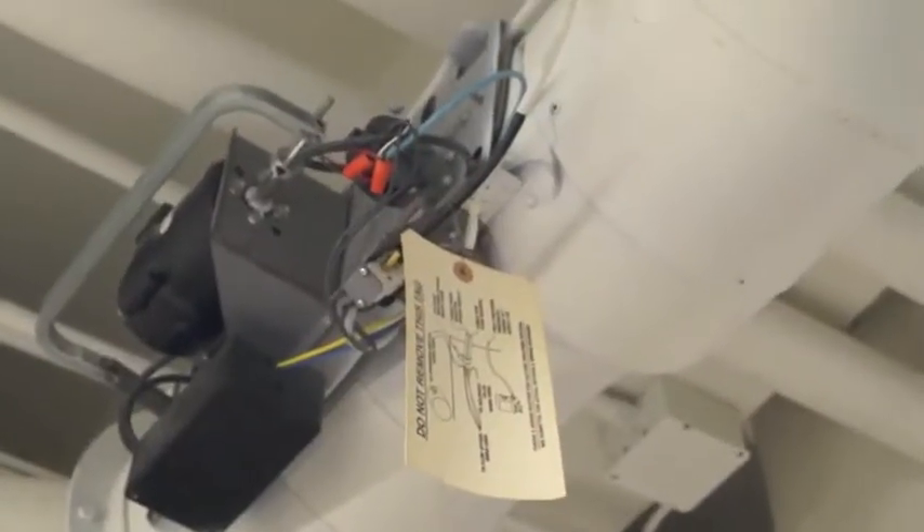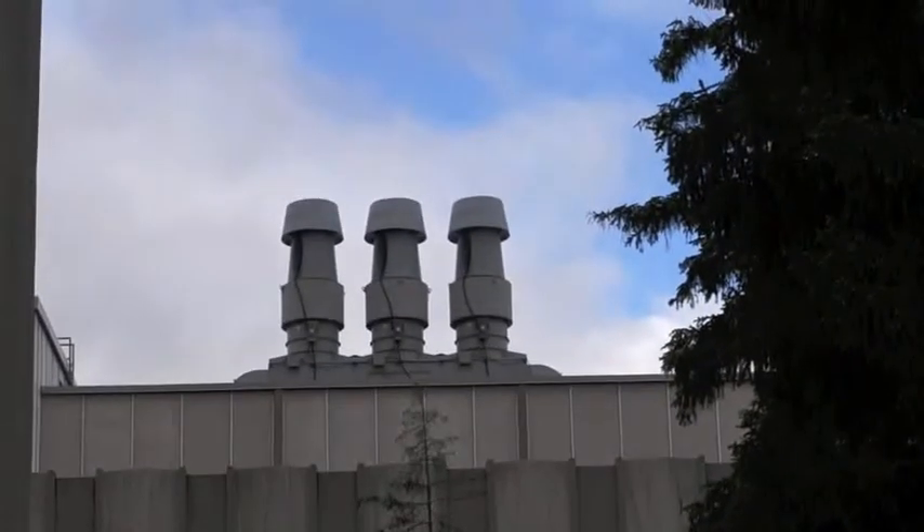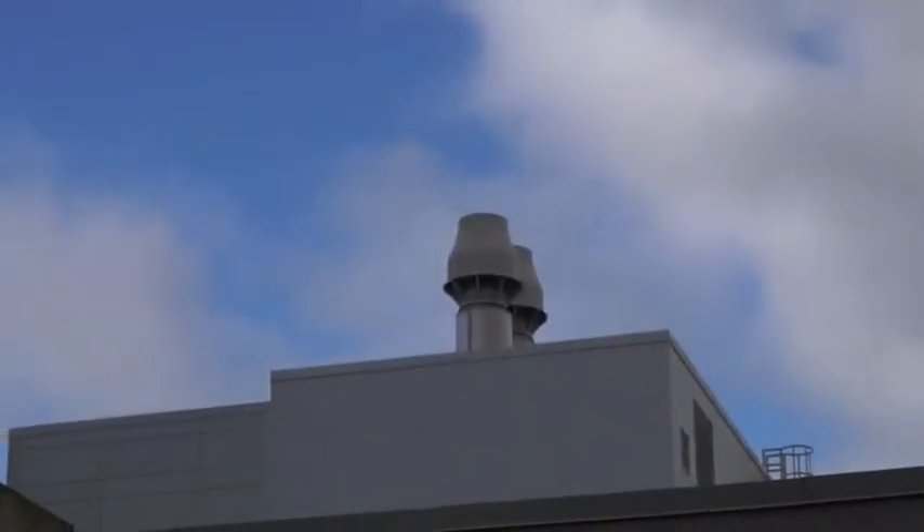The fumes contained by the hood pass through the ducts to the ventilation system. The contaminants are then expelled through the exhaust fans, which maintain a velocity that allows the plumes to dilute.